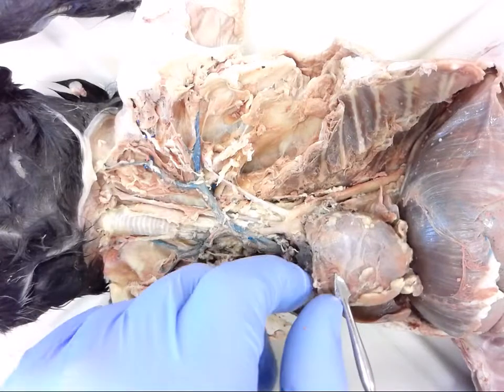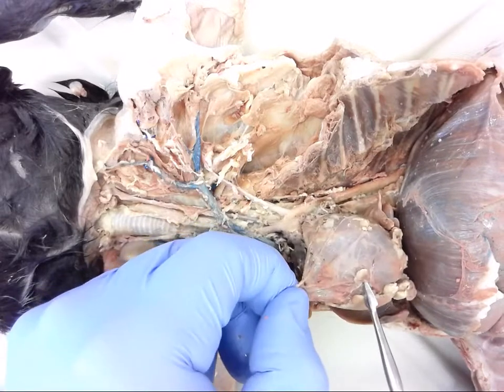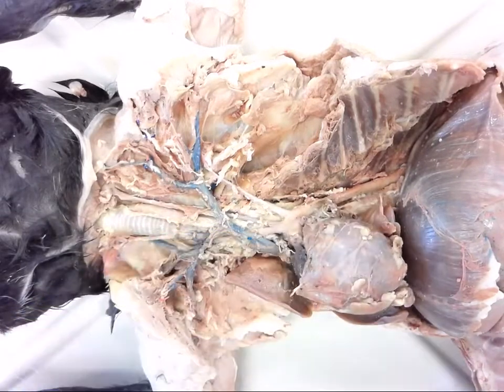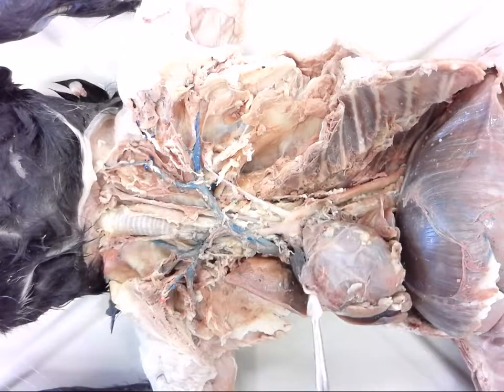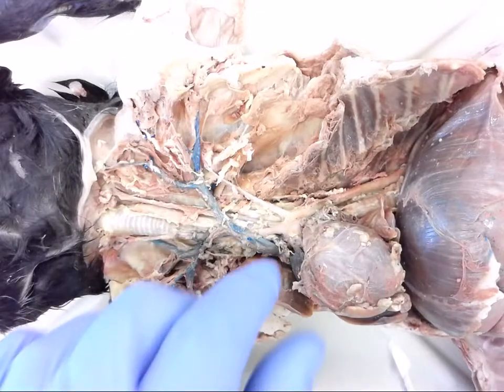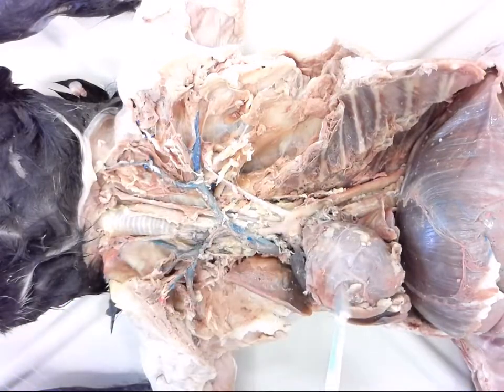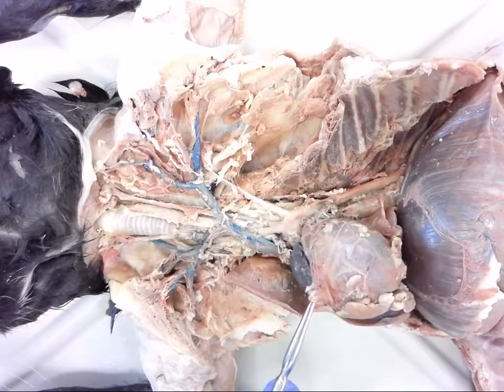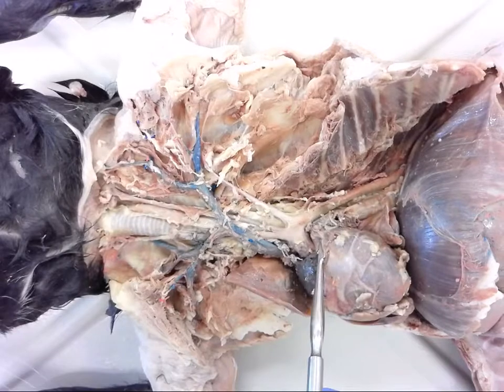Now, with this, the heart lies right in the middle, and on top of the heart we have this membrane. Okay, this is covering the heart in order to keep some fluid in there. And what we have here is the pericardium. All right, and I have removed the top part of this. Actually, very thick, very strong, and I've removed it so we can see the aorta.